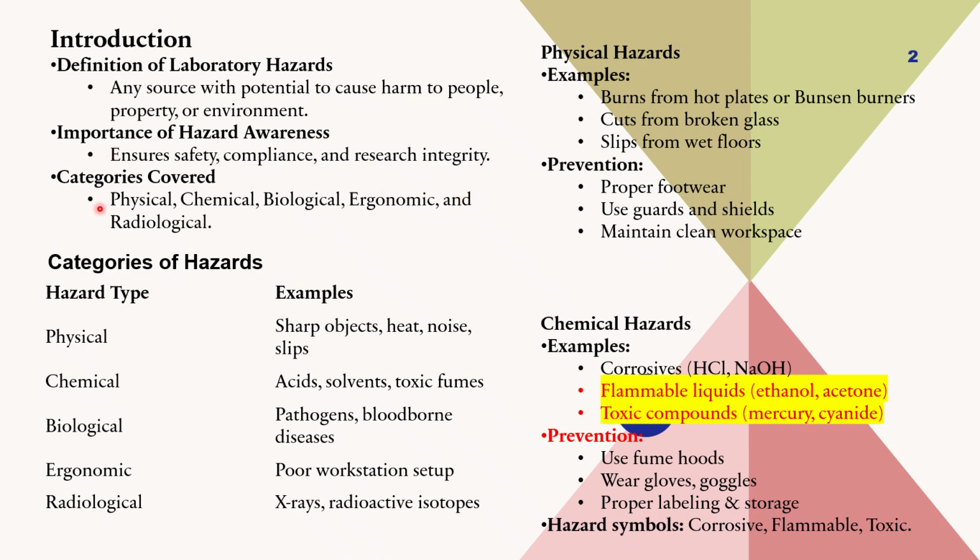Now, what are the various categories of these hazards in the laboratory? They can be physical hazards, chemical hazards, biological hazards, ergonomic hazards, and radiological hazards. So let's discuss one by one.